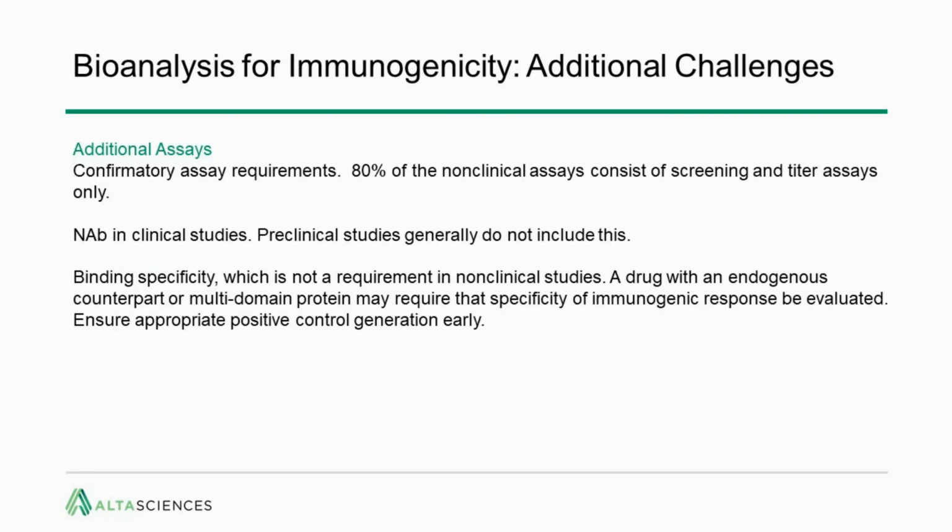There are additional challenges with regard to bioanalysis for immunogenicity. Specifically, 80% of the non-clinical assays consist of only screening and titer assays, whereas confirmatory assays were required once in the clinic. In confirmatory assays, samples that are positive in the screening assay are subject to confirmatory assay to demonstrate that the anti-drug antibody response is specific to the product.